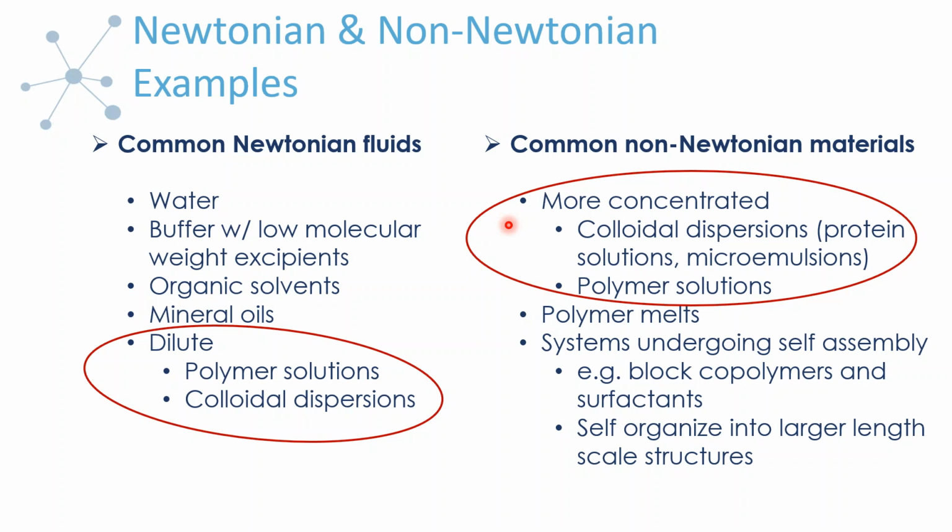And this is in large part due to differences in particle size, polydispersity, but also any interactions between the different particles in solution. The more interactions they have, the tighter they interact at low shear. But as you increase the shear rate, the shear stress and shear rate break down these interactions that the molecules in suspension have with each other. So just wanted to point out that it's not size but ability to interact that can influence the structure of your fluids.